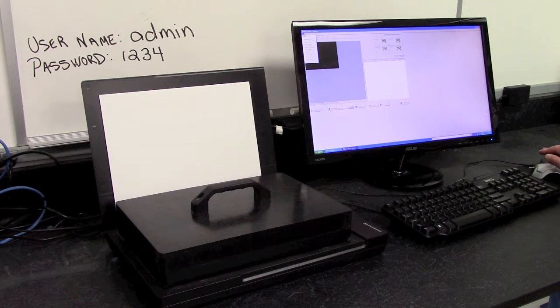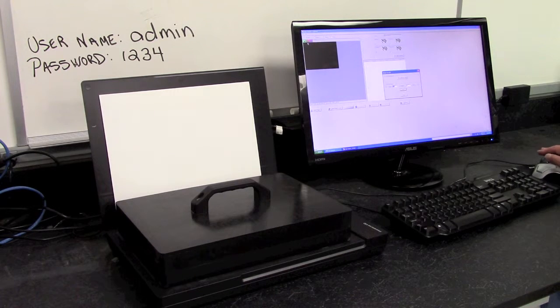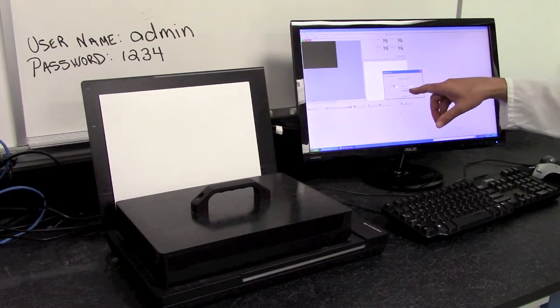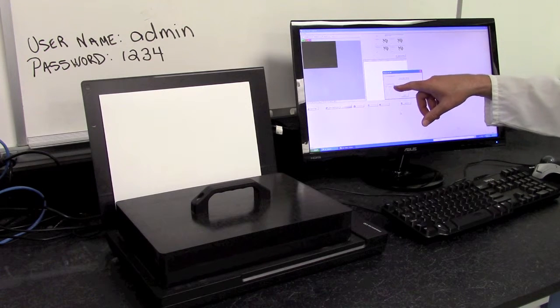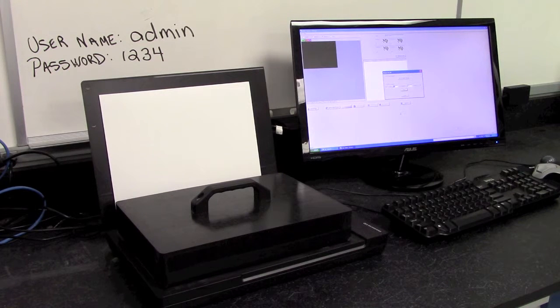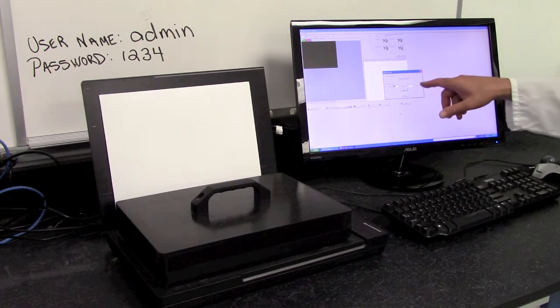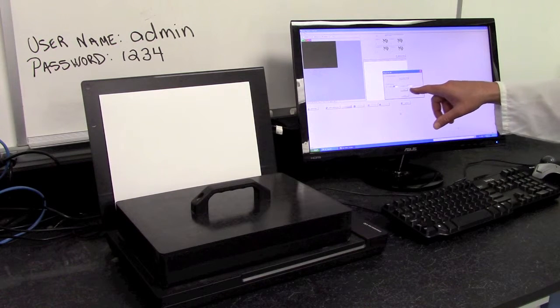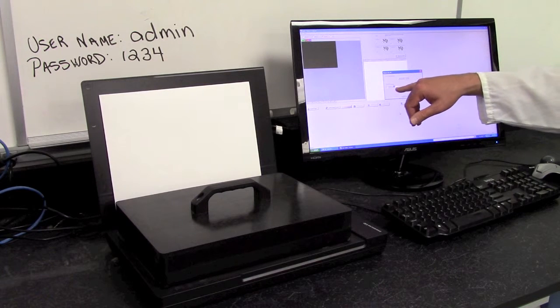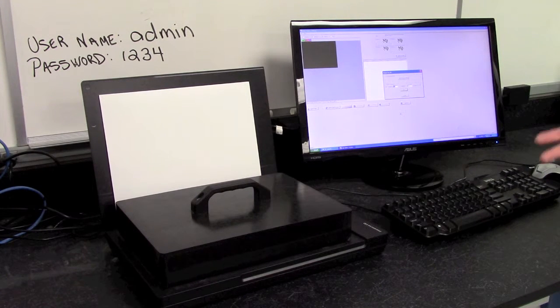Okay, so to go back to the software, if we exit out of this screen, we go back, and we're on our home page. Under File, we have an option called Setup Cutoff, or Setup Cutoff Value. Here, and we'll get a closer view of this. So here we have a threshold that says what is going to be negative. So we have a value, any value between 0 and 4.5 is what's considered a negative value with our test. Anything that's positive is between 6 and 10. That's considered a positive result.